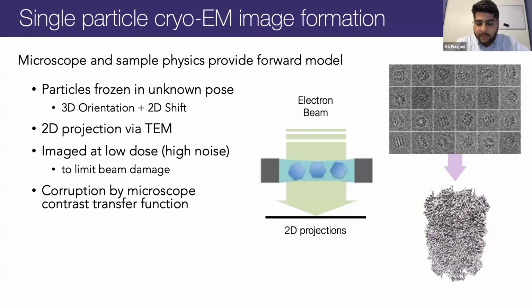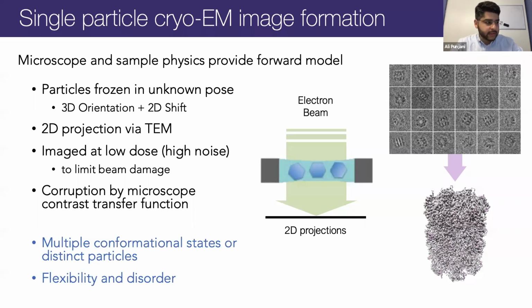In general, in single particle EM, reconstruction of the target is the task. However, in 3D variability and when resolving heterogeneity, it's really the dynamics, the motion, the heterogeneity, association, dissociation, and conformational changes of the protein that we're interested in. It's possible to investigate that using single particle EM thanks to the characteristics of the protein itself, which are the other part of the image formation model.